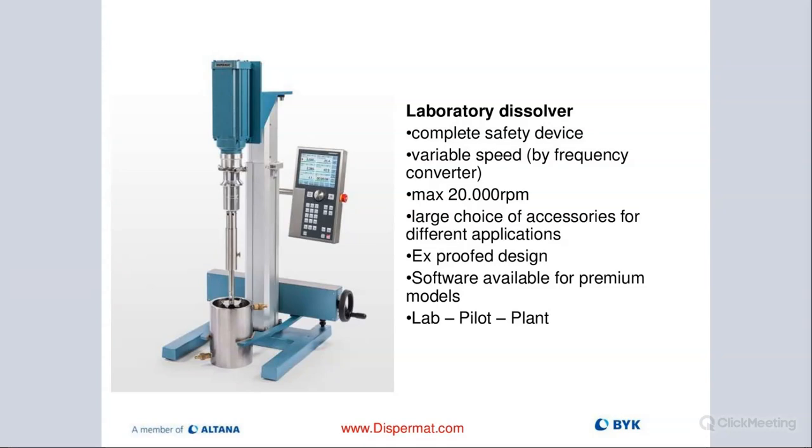So if certain products can reach a certain temperature, you can build in thresholds so that the machine will behave differently once it reaches a certain temperature, either run with a different or lower energy input or different speed, or that the machine will shut down altogether once it reaches that temperature threshold to really protect the material. It's an excellent tool for upscale.